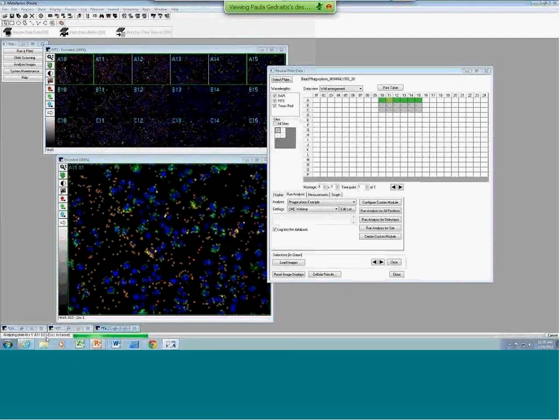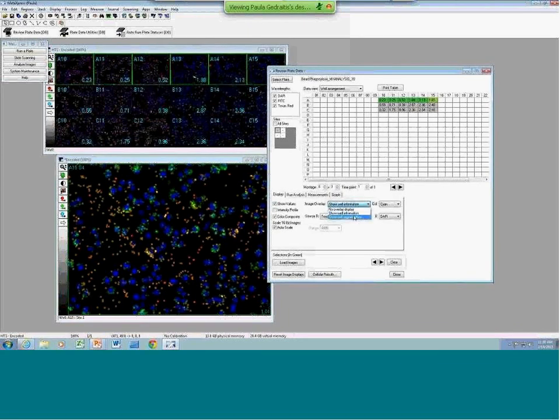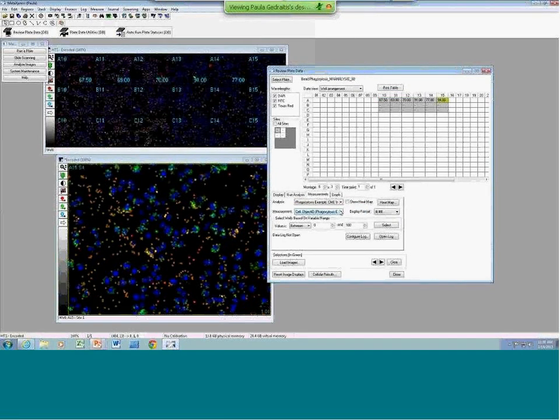And you'll see it runs nice and quickly, much quicker than most of the custom journals that you might have tried in the past. I'm not running PowerCore, so with PowerCore it would run even faster. This is typed for well. Okay. Now you can see, here we go. I can see my measurements.